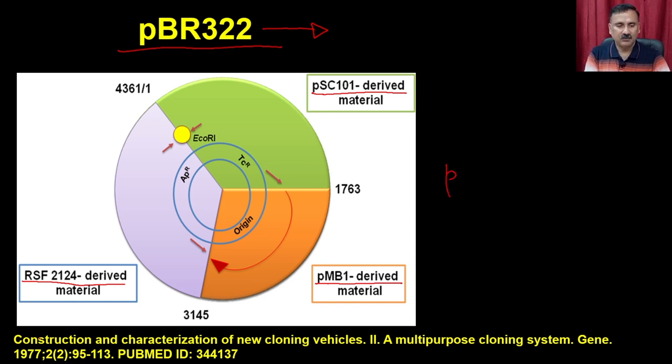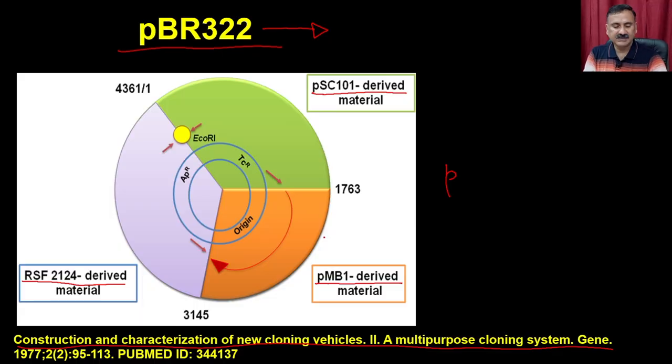And I have given you the link with the old paper where they developed this particular plasmid, and you can go through it to understand how people are designing or developing new plasmids.